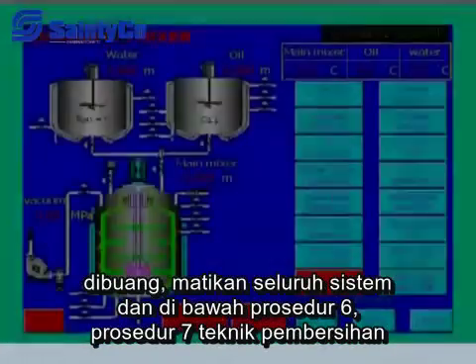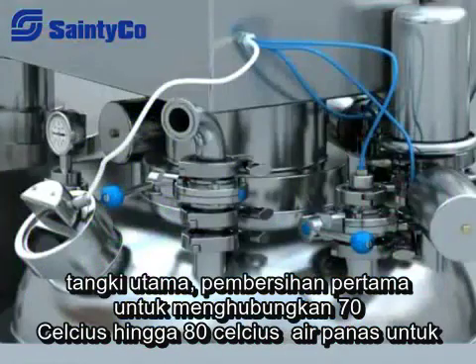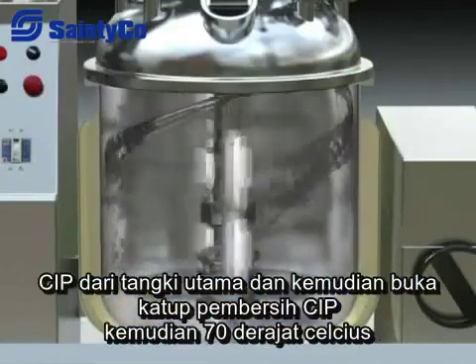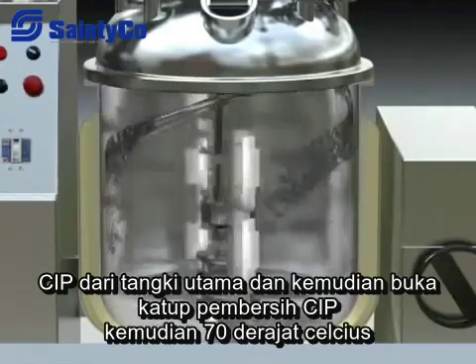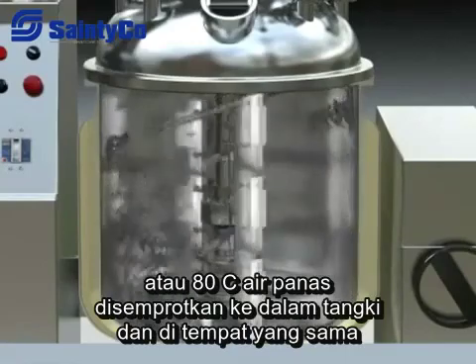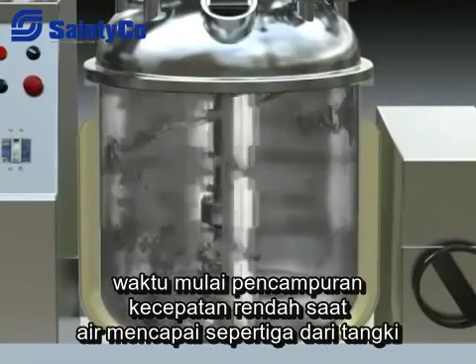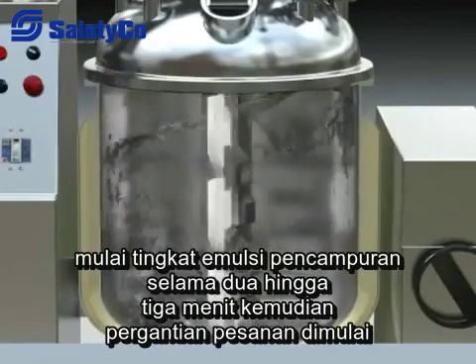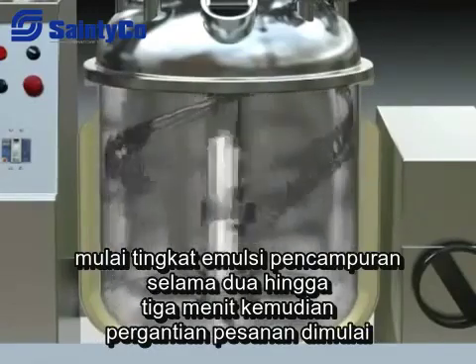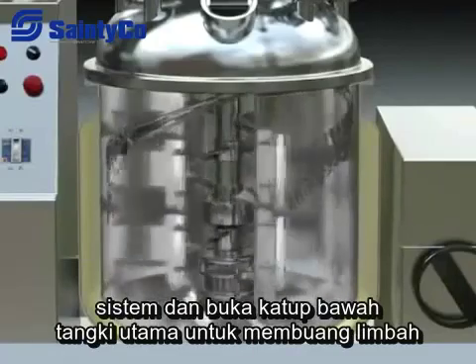Turn off all systems and enter the sixth procedure. For main tank cleaning, connect 70-80°C hot water to the CIP inlet of the main tank and open the CIP cleaning valve. The hot water will be sprayed into the tank; start low-speed mixing at the same time. When the water reaches one third of the tank level, start emulsifying mixing for two to three minutes. Then turn off all systems and open the bottom valve of the main tank to discharge the waste water.